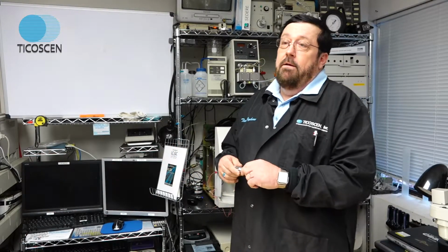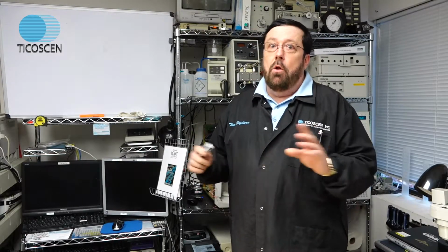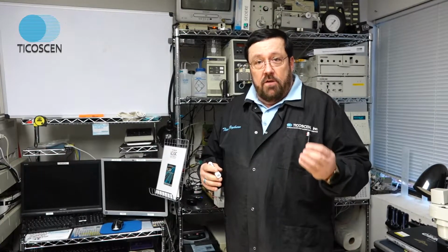What is bad water, and why should you take it seriously with your ELSDs? This is a big topic for me, and I'll try to boil it down to 2 minutes. But water is a constant issue for me with ELSDs with clients all over the country. Water, for scientific purposes, is very finicky.